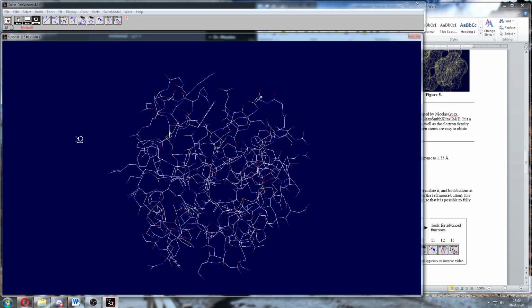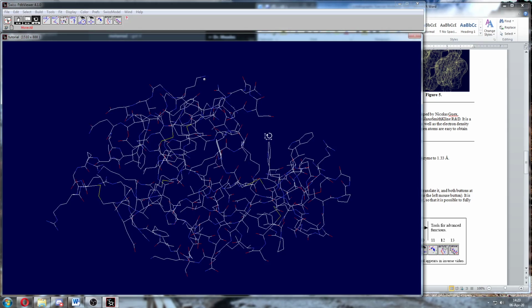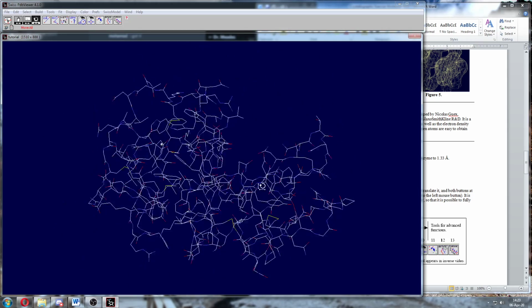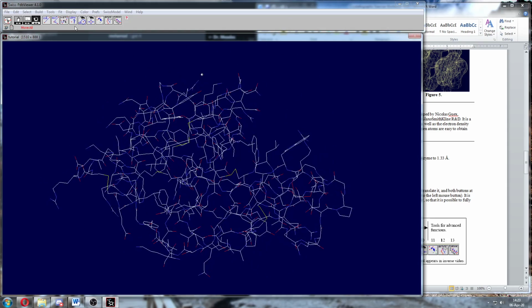Okay. Now, when we did this back in early 2000s, and all students do this, if you take the mouse and do something like that, it would crash your laptop. Right? But modern computers can handle this rather well. Right? So practice using these functions.